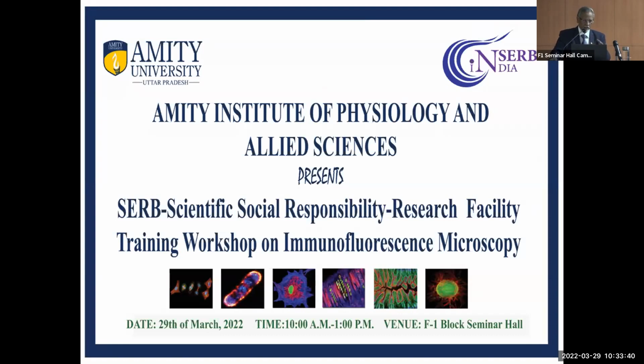Those who have experienced fluorescent microscopy know that if you stain with a fluorescent dye, there will be a lot of staining, but an experienced eye can tell which is right and which is wrong. Many things can take the stain. That is why it is very important that you are experienced with it. He declared that it was a male baby, and ultimately it was a female one. That led to a lot of problems.